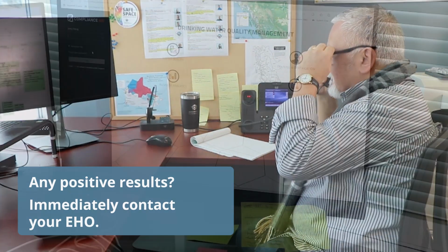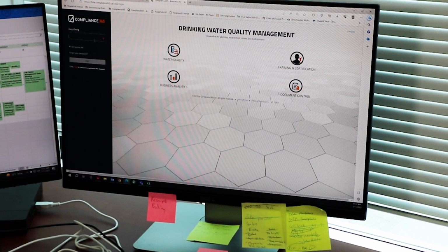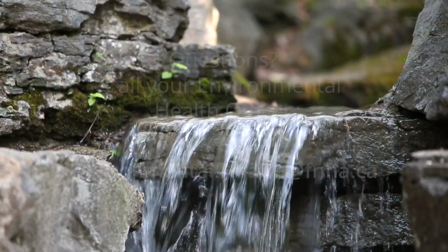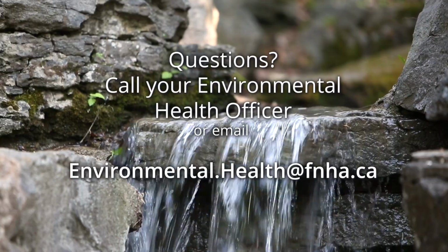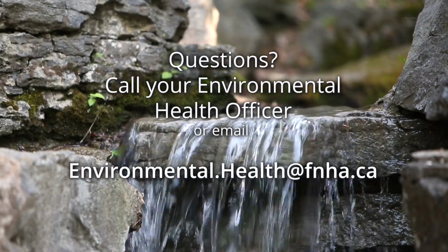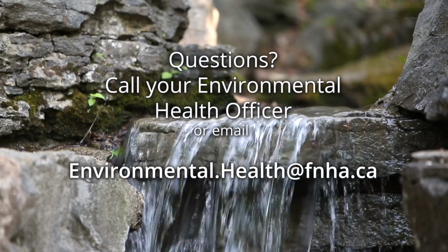Once you are done recording your results on your field data log sheet, you now enter the results into Compliance 365, our water data management system. If you have any questions about how to process water samples, contact your friendly community environmental health officer. Please see our other videos in the community-based water monitoring series for more information on how to select a sampling site, how to take a sample, and how to use the chlorine test kit.